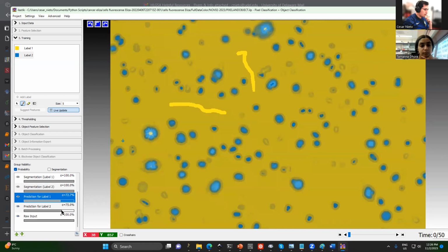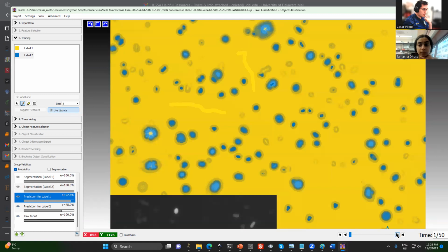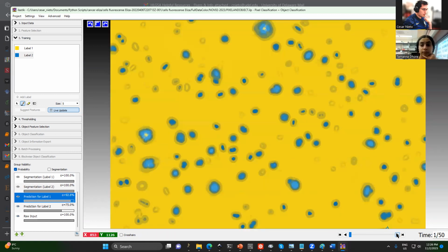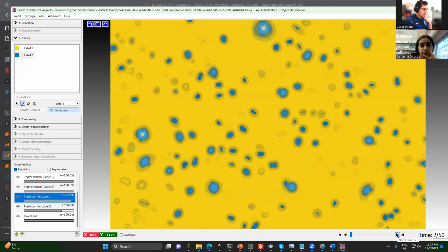Okay, we don't need something very fancy. Let me see another figure here. Okay. Let's say we are playing with this. Otherwise, I have to paint more and more.